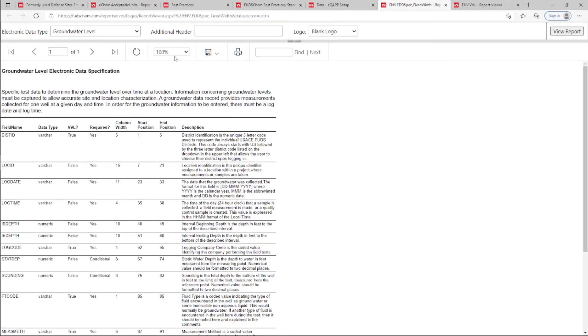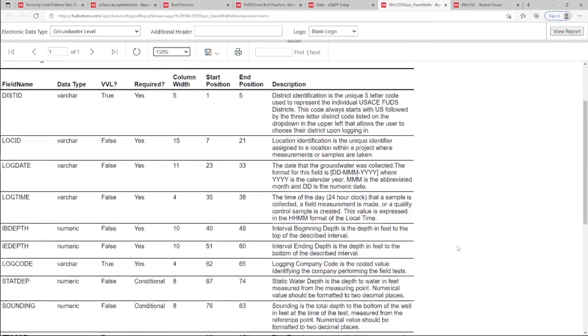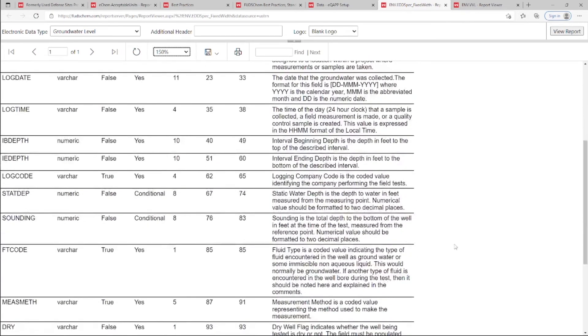We can see from the descriptions that for Interval Beginning and End Depths, as well as for Static Water Depth and Sounding, measurements need to be loaded in feet.